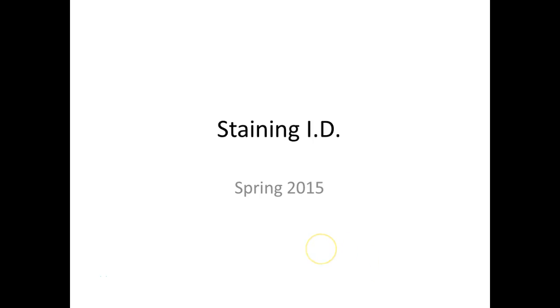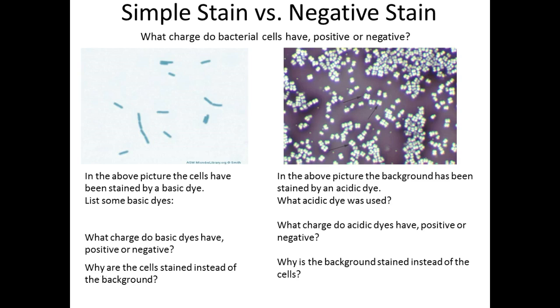So this is the handout, staining identification. And so the first stains that we did and we learned about that you need to know for your exam is simple stains versus negative stains. So I have an example of each.